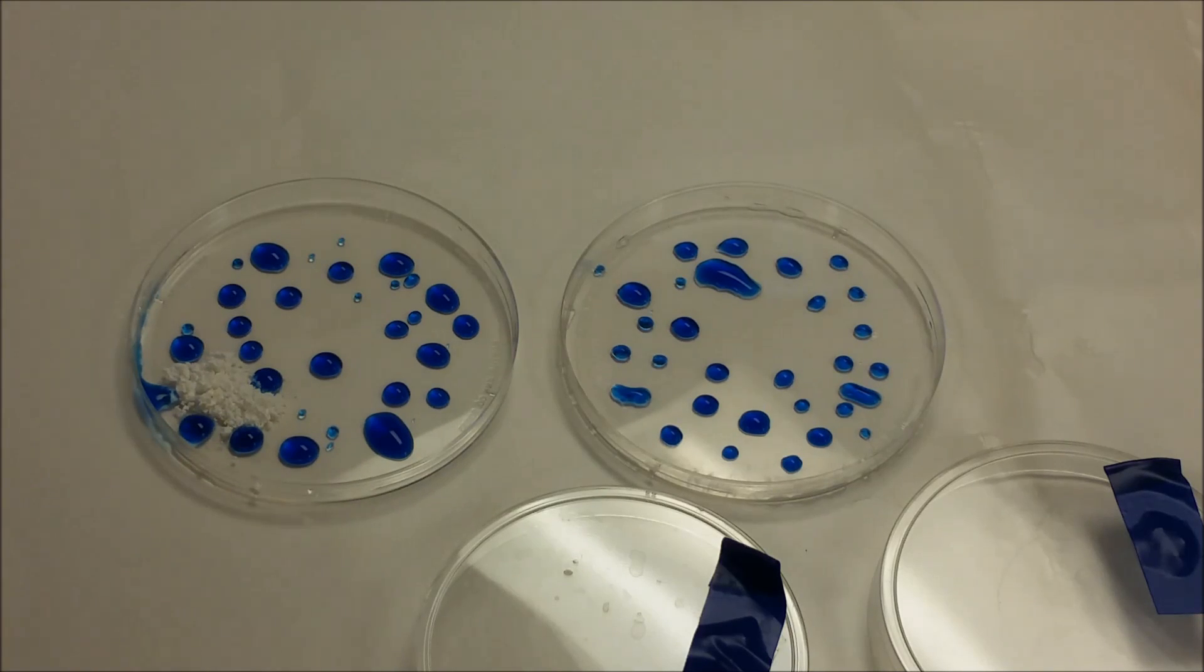These petri dishes we're going to use for a mini acid rain activity here. We've set up some bromo-cresol green in both of them, and little droplets all the way around.